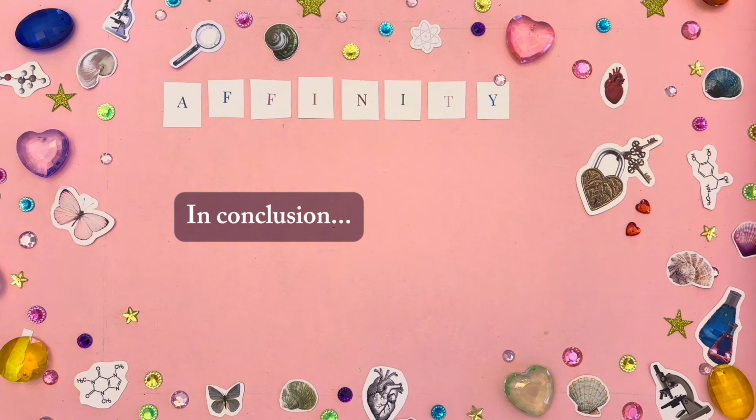Having learned all of this, I'm ready to discuss the final method of hydrophobic interaction chromatography.